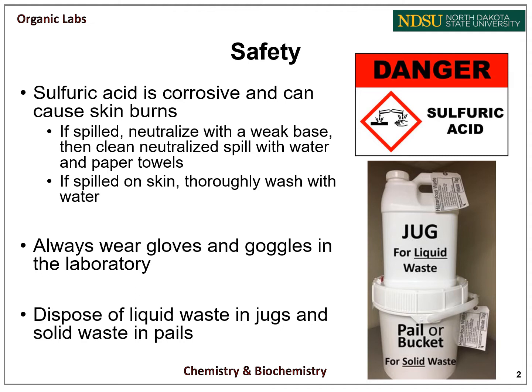If you spill some sulfuric acid, it first needs to be neutralized with a base like sodium bicarbonate. Then clean the neutralized spill with water and paper towels. If you spill some sulfuric acid on your skin, make sure to thoroughly wash the skin with water. Always wear gloves and goggles when in the laboratory. And dispose of liquid waste in the liquid waste jugs and solid waste in the pail.